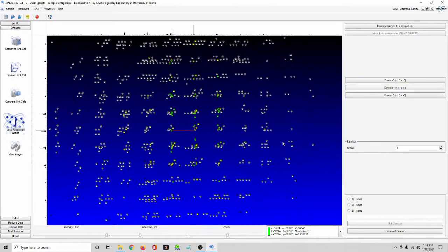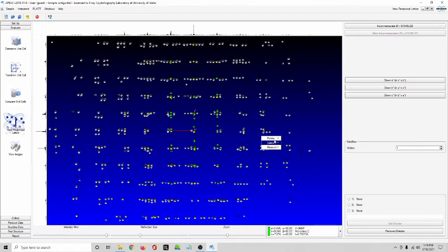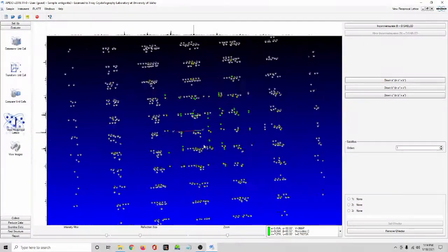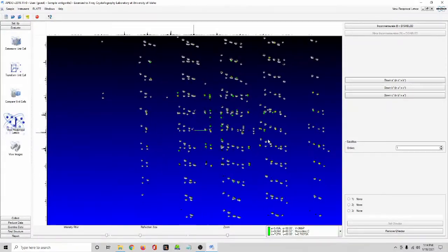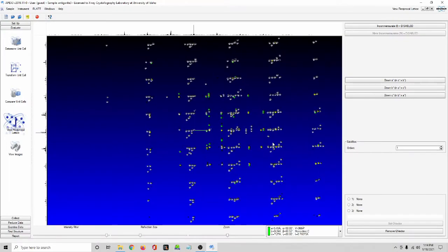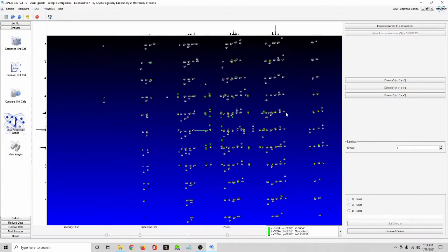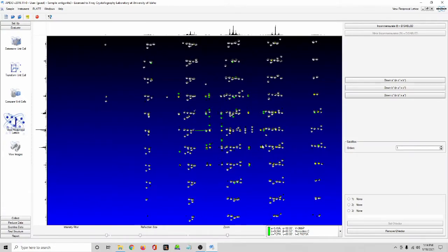Looks like there's definitely some missing ones, but that could be in part due to this twinning, which we're going to have to handle at this point now, because it's going to be very difficult to navigate if we don't. So align it in such a way where you can pick out the lattices. Alright, so you can see these are our main reflections here, and we have this intersecting satellite peaks from the other twin domain.